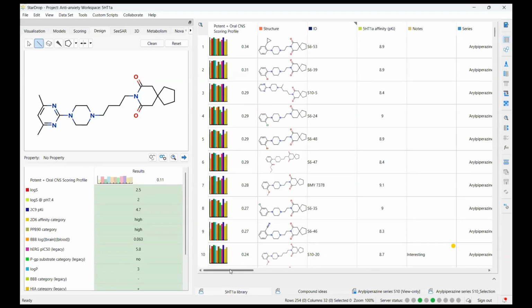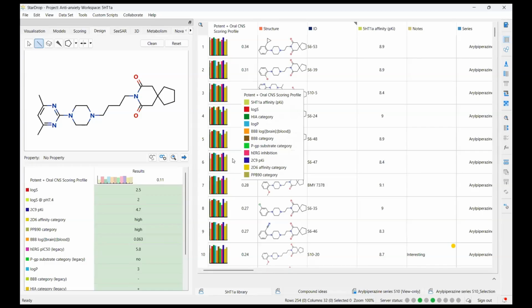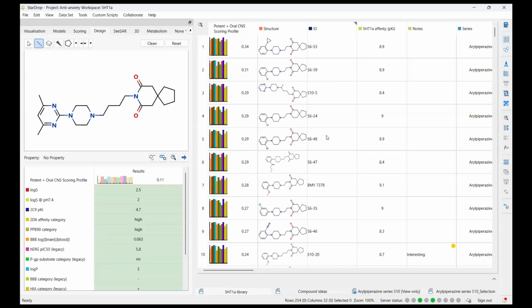Indeed, what I've done is actually create another workspace within this project looking at this. We refer to the way we're looking at everything, this view, as a workspace. I'm going to open up another workspace looking at exactly the same data set here, but you'll see that it's displaying everything completely differently, despite the fact that underneath it, I've got identical compounds and data.